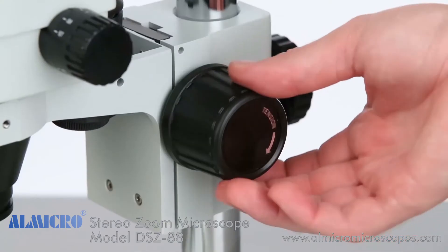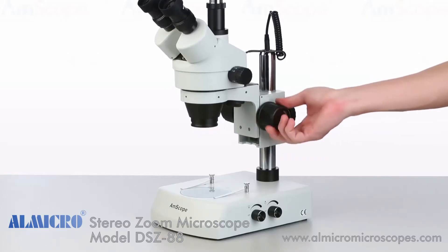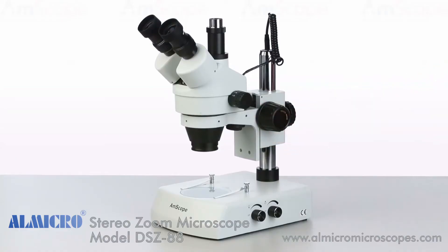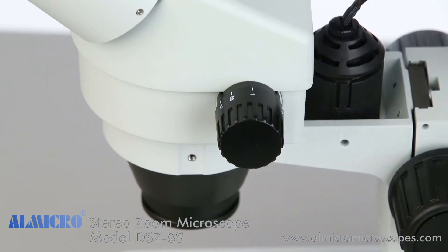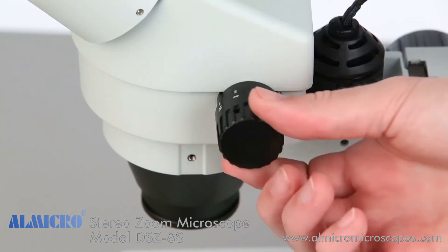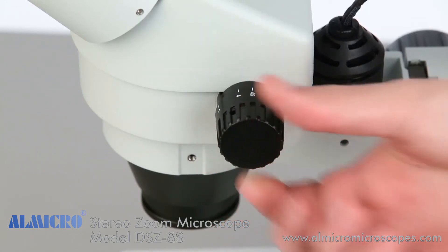There is an adjustment knob on either side of the microscope to control your fine focus. The calibrated knobs on either side of the head control the zoom from 0.7 times to 4.5 times magnification.